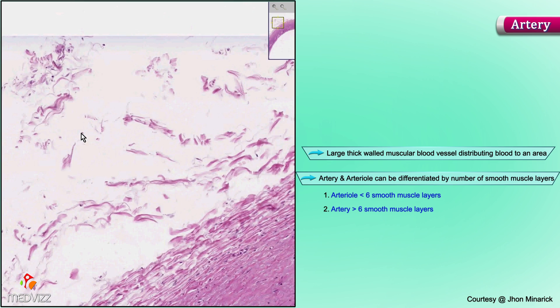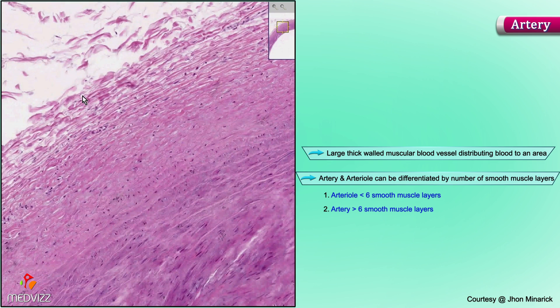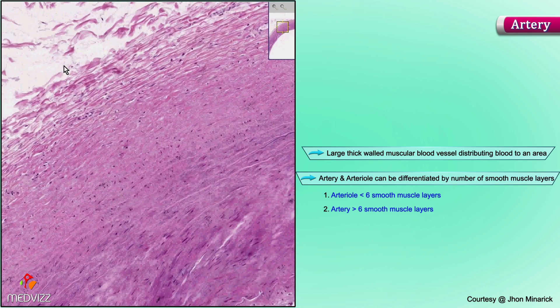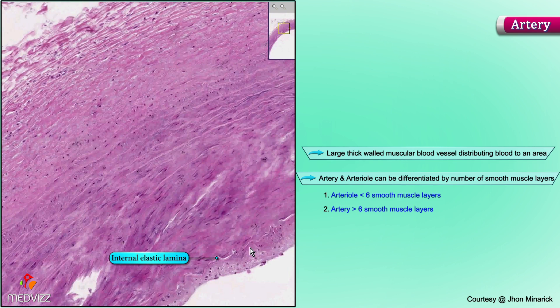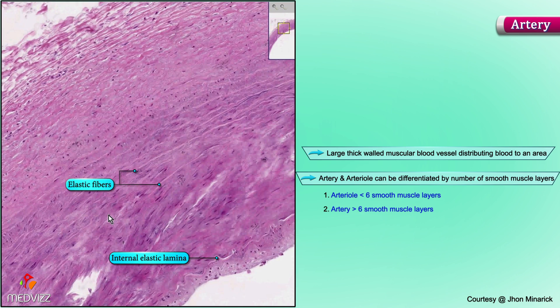But remember, if it's an artery, it will certainly have an internal elastic lamina. If it's a large artery, it may have more elastic bundles towards the lumen, or it may not have any more elastic fibers at all. But the wall will always be chiefly smooth muscle cells.